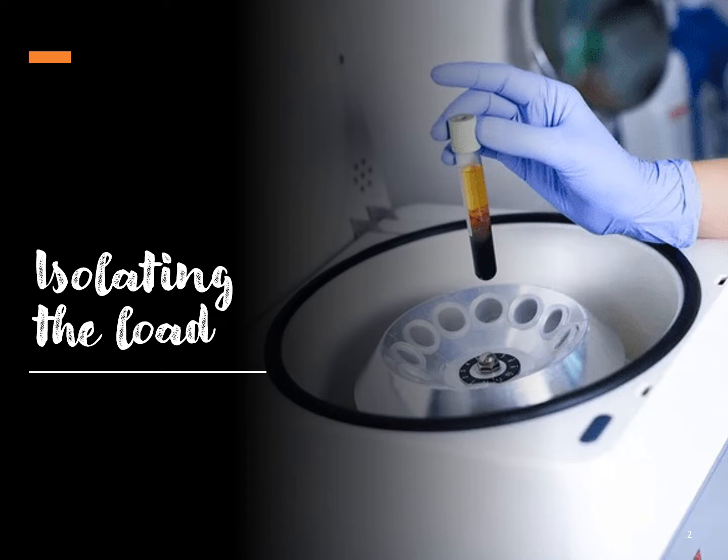For that purpose, you will require a column which has special beads which can either bind to the specific tag which your protein of interest has, or which can bind to your protein based on its specific charge. So on these beads, you're going to load your lysate, and therefore this clarified lysate. What do I mean by clarified lysate?